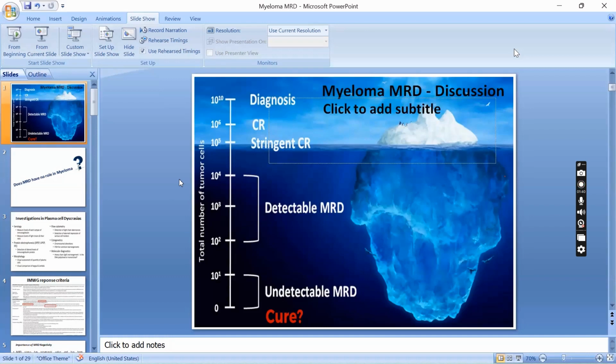So whenever you are doing bulk lyse, stain and wash, or to make it simple, when you are lysing the sample before staining it, never use a lyse with fixative. Always use a lyse without fixative. If you are doing stain, lyse, wash, it's up to you, you can use lyse with fixative or without. For MRD, it's always lyse without fixative, since we do bulk lyse, stain, wash.